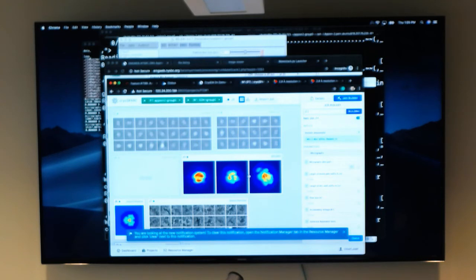That's J6. It's a funny thing, you have to select. So we use this as the selected particles as the input. Yeah, should be. And just drag this and try again. Mhm.